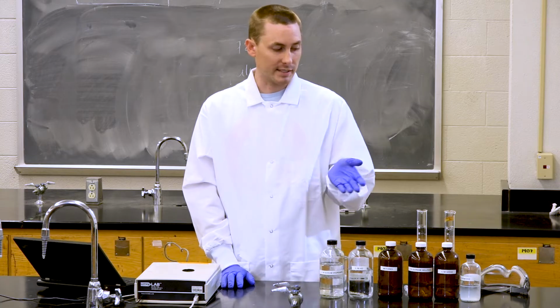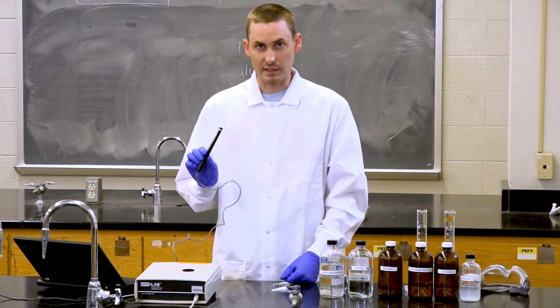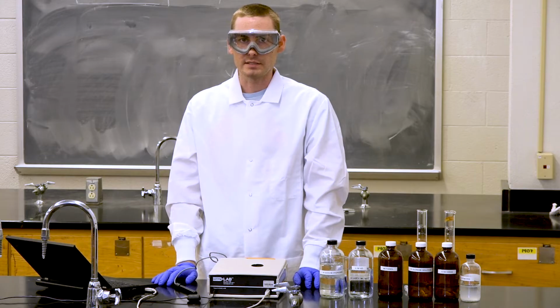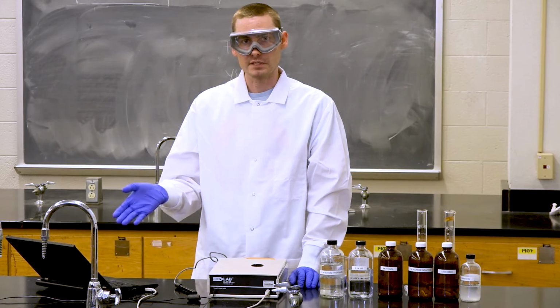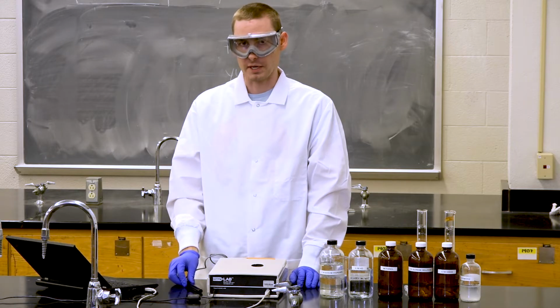Let's get started by testing some of these solutions first and see what their conductivity is when measured with the conductivity meter. So before we begin testing the conductivity of different solutions, we need to first set up the computer so that we can begin taking conductivity measurements using the microlab.